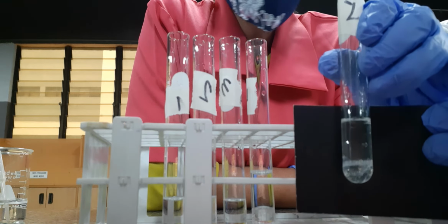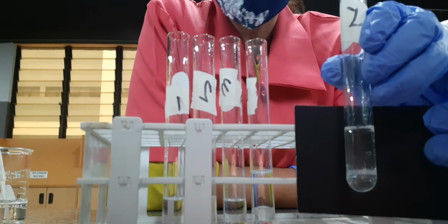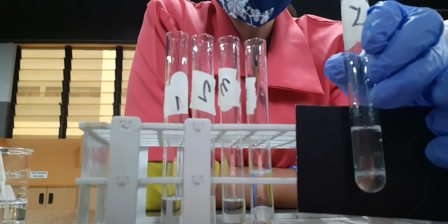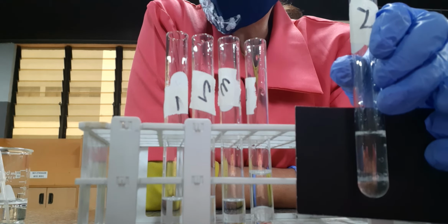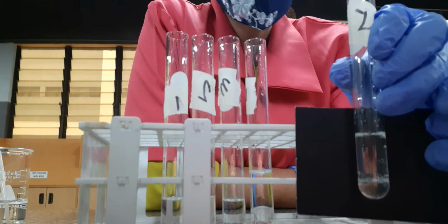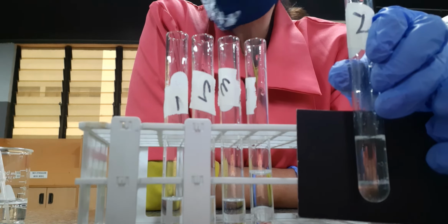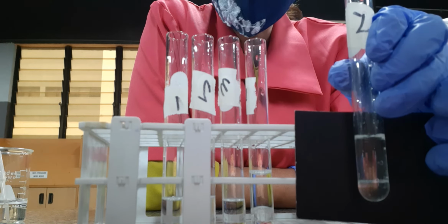Now you try, because you will not be able to identify the odor from this, so try to research what will be the odor of acetophenone, benzaldehyde, and acetone. Of course, you know already the odor of acetone, but try to know the odor of formaldehyde, acetaldehyde, and acetone also, what is the correct term.